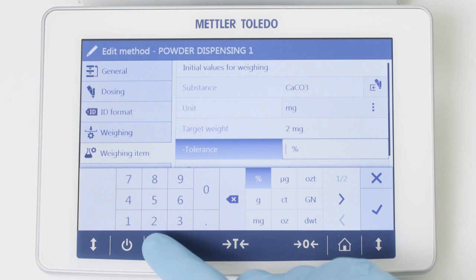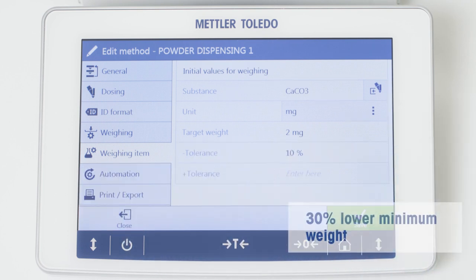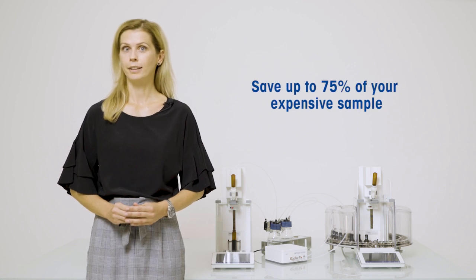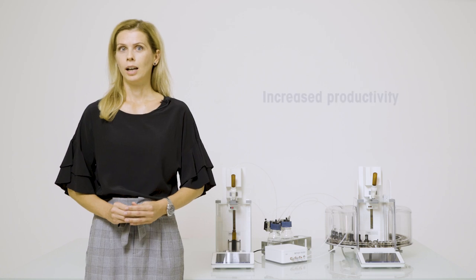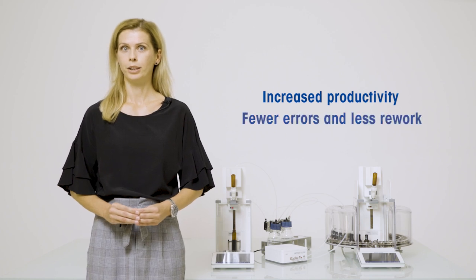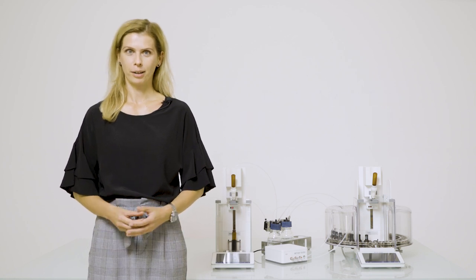The minimum net sample weight can therefore be reduced by up to 30%. This means you can make considerable savings by using less of your expensive and rare samples. Moreover, highly reproducible results of the automated dispensing help you eliminate potential sources of error and avoid rework, so you save your precious time.